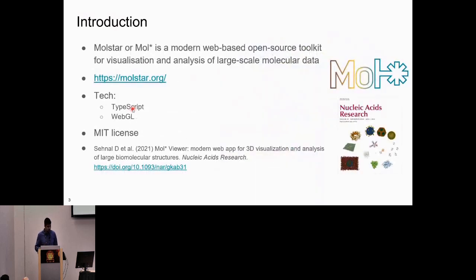If you haven't heard about Molstar before, Molstar is a modern web-based open source toolkit for visualization and analysis of large-scale molecular data. This is the URL for Molstar. Its technology is based on TypeScript and WebGL. It's released under the MIT license.